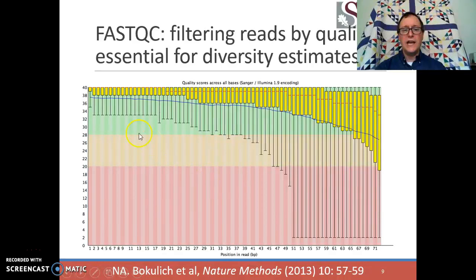So here we're looking at the average quality score for nucleotide 1, where the median is 40, which is to say it has a 1 in 10,000 chance of error. In fact, we can go all the way out to nucleotide 50 before we start seeing that a probability of error yields a Q value of less than 38. So this is a pretty good sequencing run. That said, occasionally we see that the base call at position 50 dips below 20 for some set of sequences.